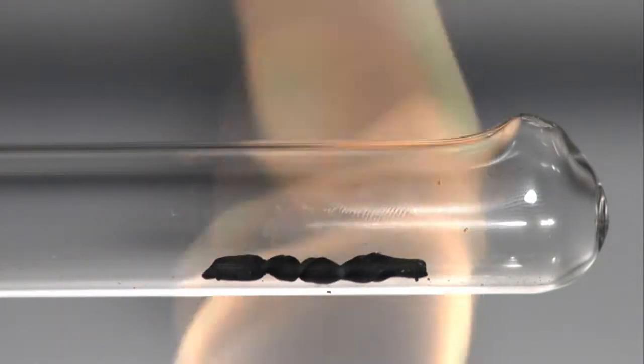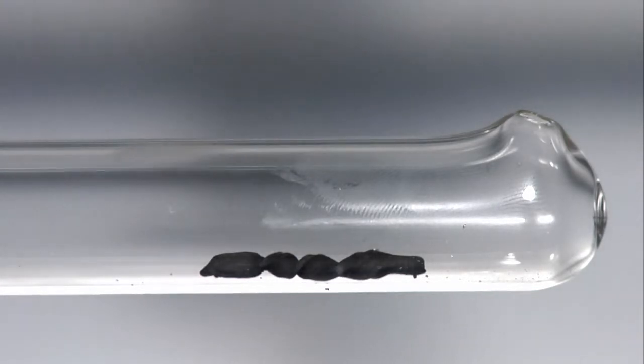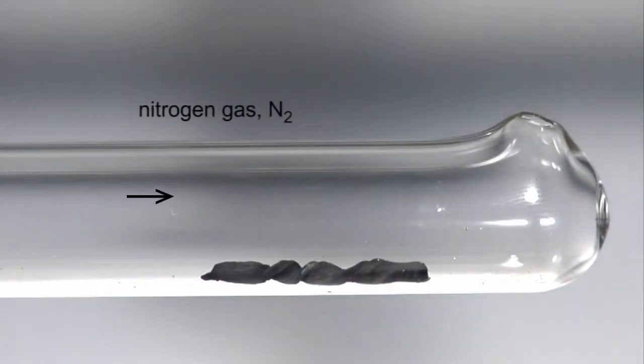Some small pellets of lithium are placed in a boiling tube, which has a vent blown into its end. Pure nitrogen gas is passed through the tube, and the lithium is heated with a Bunsen flame.